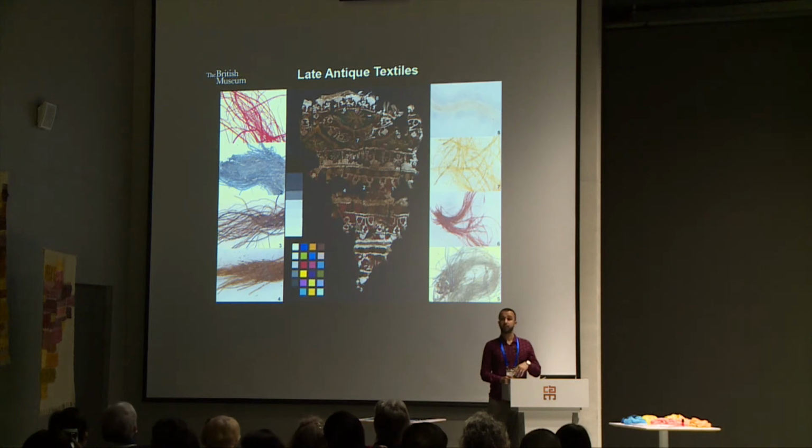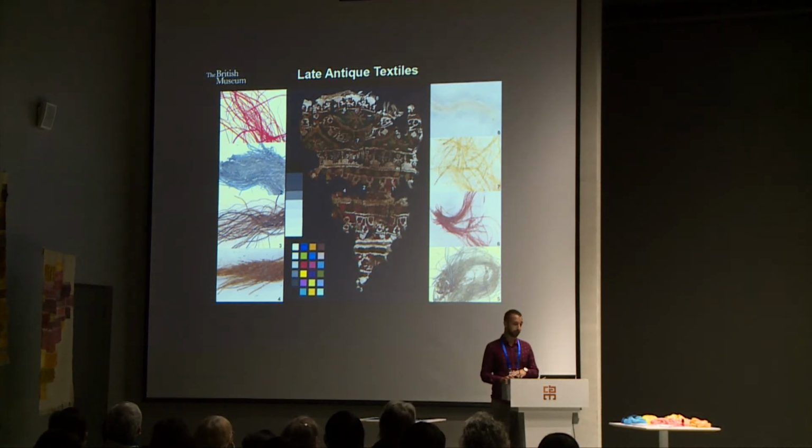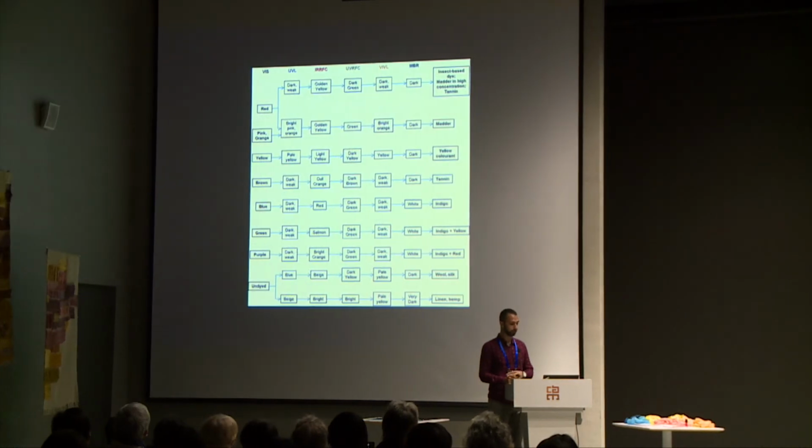The results told us that the palette was very, very limited, so we could find only madder, indigo, a source of yellow, which was a luteolin-based yellow, very consistent with weld, but yeah, there is discussion about weld being used in ancient Egypt. And then in the furnishing textiles, we found tannins for the brown. So four base colors to obtain all the shades that they were obtaining in these textiles.